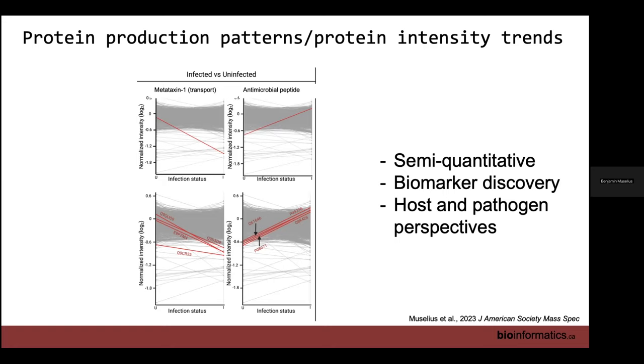You said you use your graph for the predictive biomarker, yes? I wonder how you figured out, you found many proteins, but now you have different categories. For example, the group is related to antimicrobial peptide, the other is for the other groups. How do you figure out, for example, this group of proteins is related to this pathway or this mechanism, and the other one is related to the others? How do you find the pathway or function of your proteins? You create this graph.